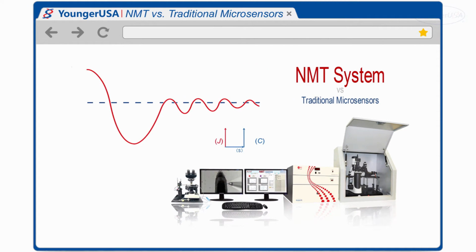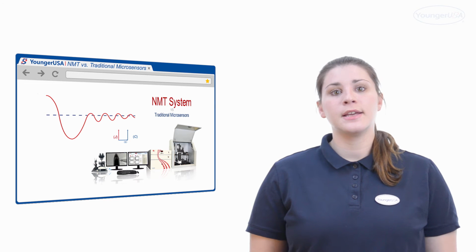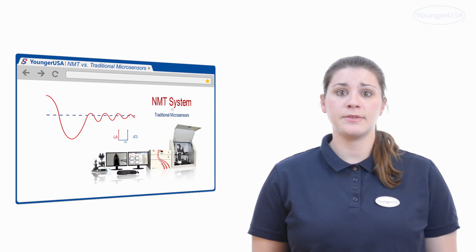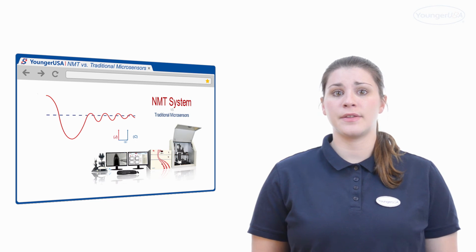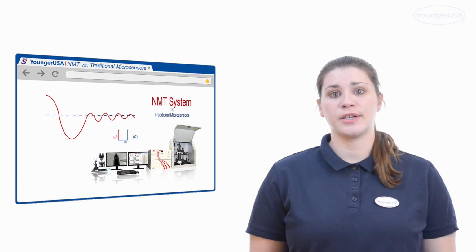NMT detects both magnitude and direction of the hydrogen ions around the Arabidopsis seedling, showing much more than just the static ionic concentration that is found with traditional technologies. The results are obvious. If you are looking for a technology that can study living samples non-invasively and in real time, NMT is your best choice. We recommend this technology because it is able to pick up more signals than other technologies. With NMT, your new discoveries are just around the corner.